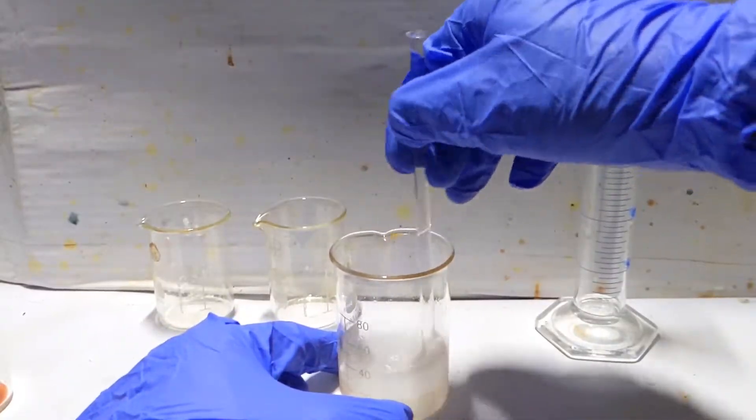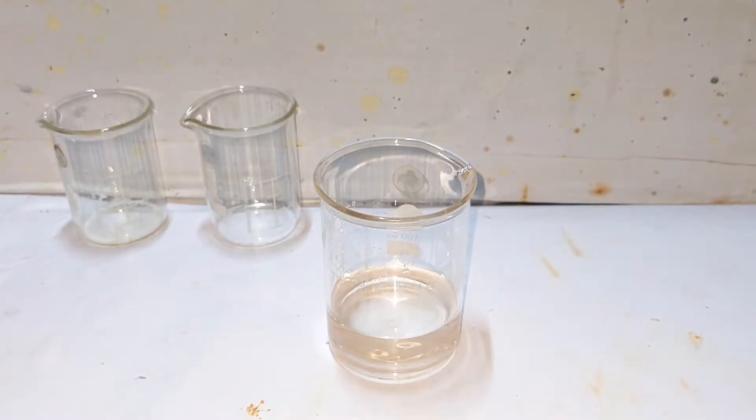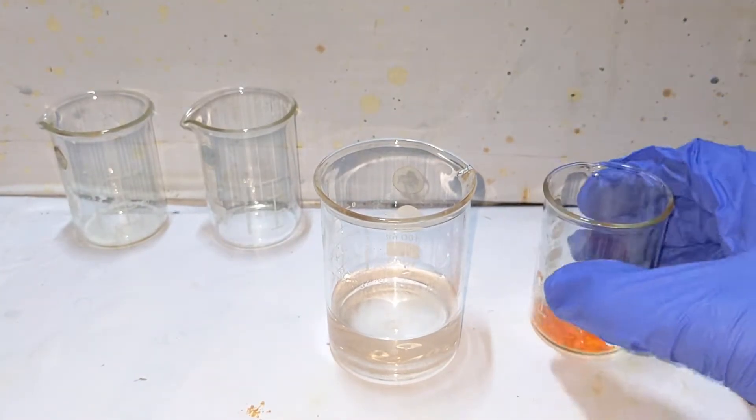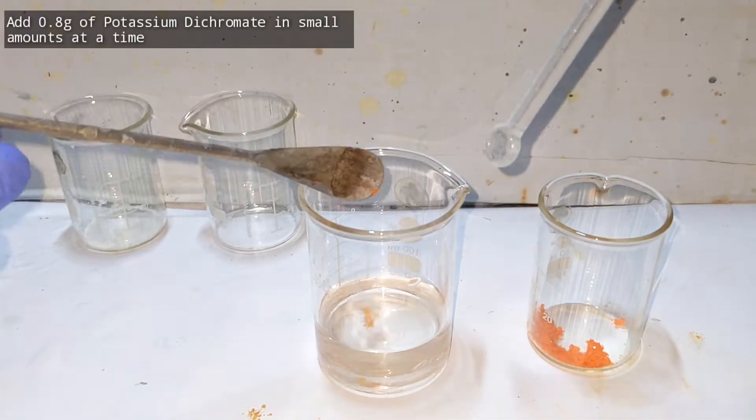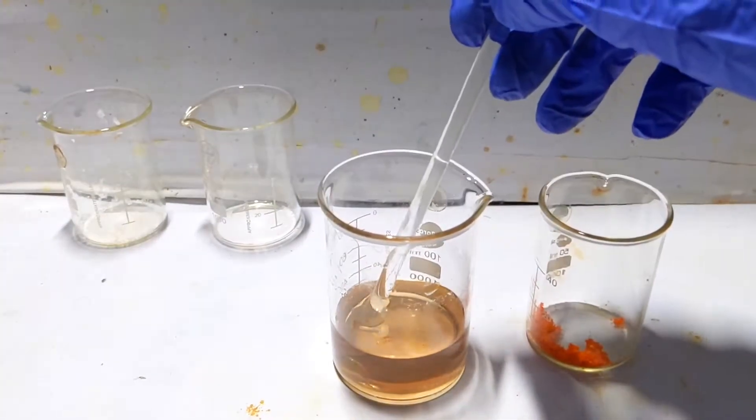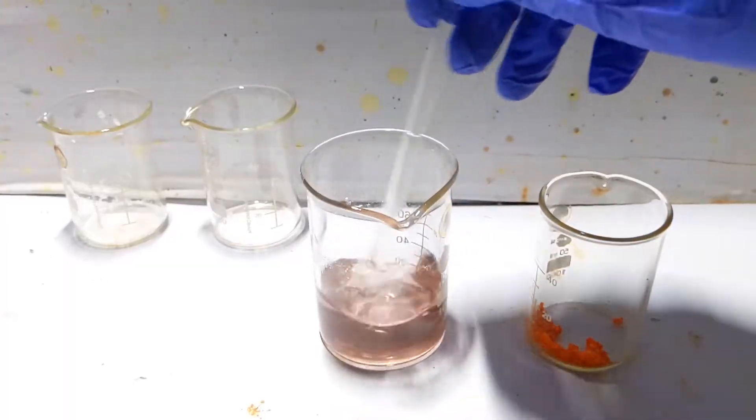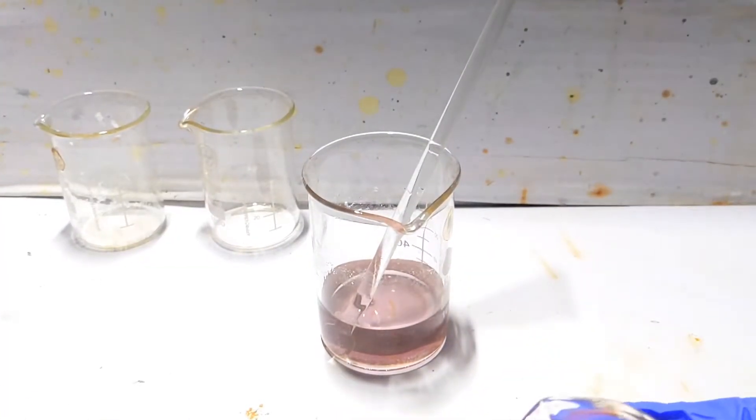Next, 0.85 grams of potassium dichromate was added in small lots with the help of a spatula. You can see how the orange color of the potassium dichromate immediately turns dark upon addition.